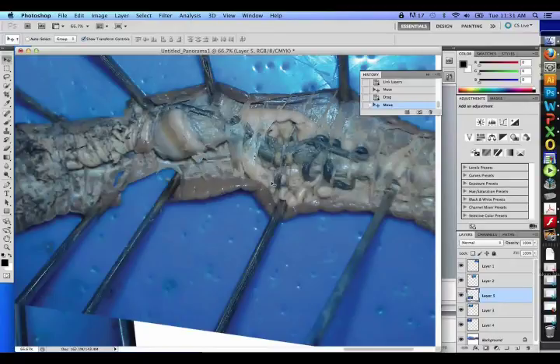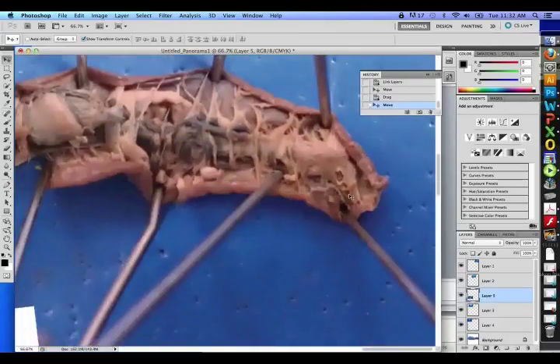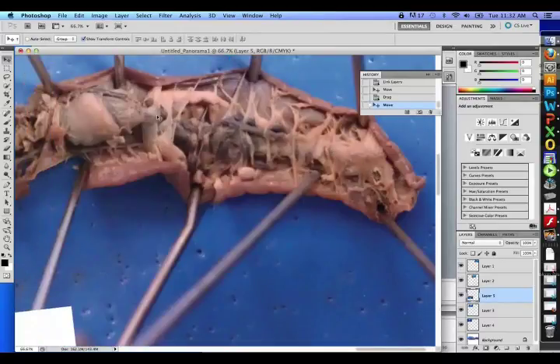So that's going to be those hearts, the aortic arches. There's 5 of them. Underneath the dorsal blood vessel, we have the digestive system. So we saw already the mouth and then the neural ganglion brain, and then we get to the parts of the digestive system. So the first part is the pharynx, then the esophagus, and that's going to go through the middle of here.